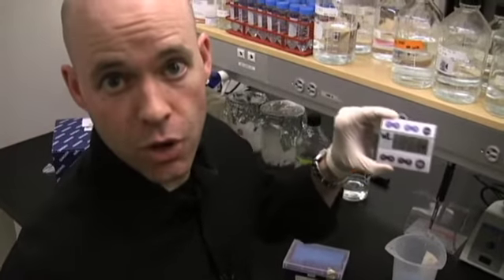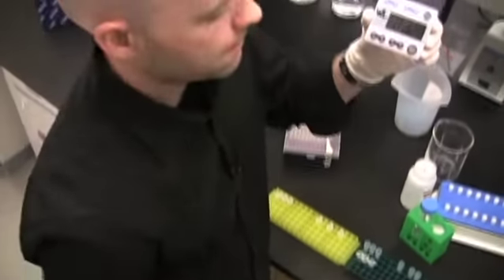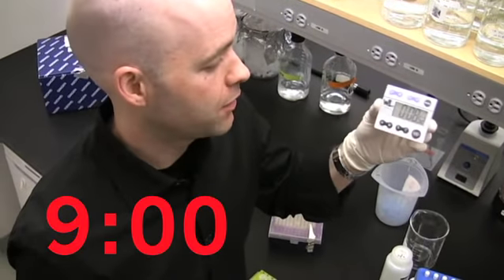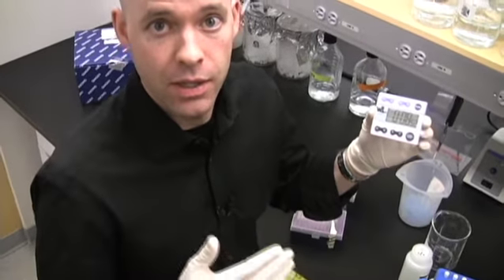It looks like just over three minutes to go from lysate to purified DNA using the vacuum manifold. Now let's see what it's going to take doing the traditional way. Almost nine minutes. So a big difference between three minutes and nine minutes, and this is only three samples. You can imagine if you have 10, 20, or 30 samples, this is going to be a much larger difference in time.